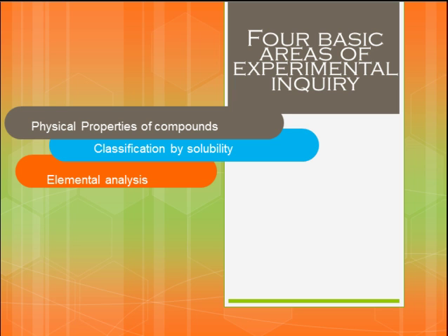Next is elemental analysis. In this part, we perform the process called sodium fusion, in which we burn or heat a clean sodium metal in a test tube. Then we put a good amount of the sample into the tube and fuse it by heating it once more. We then dip the red hot tube into water, causing it to shatter. Afterwards, we boil the fusion solution so that we are sure that it is completely dissolved. Finally, we filter it and we perform the usual qualitative tests to figure out the possible constituents.